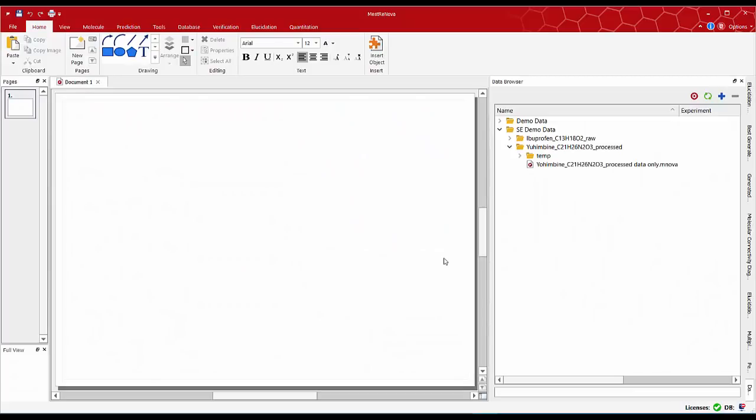Hello everyone. In this clip I'm going to show you another example of computer assisted structure elucidation by NMR. On this occasion I'm going to use a relatively complex molecule such as Yohimbine.